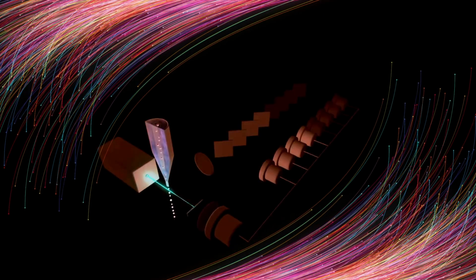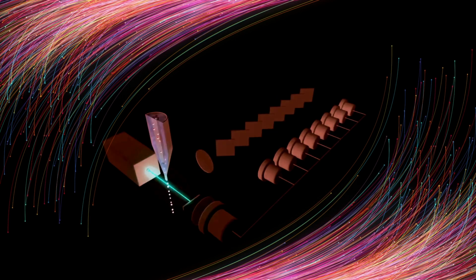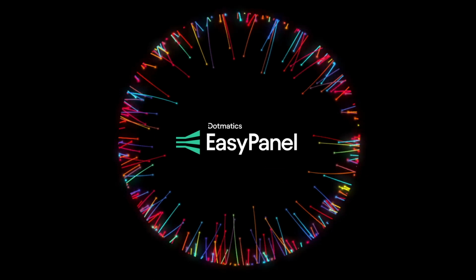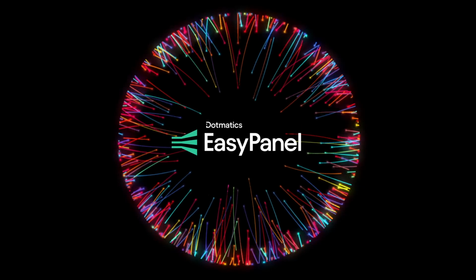One of the biggest challenges in flow cytometry panel design is selecting the right combination of fluorochromes and antibody conjugates so that the need for compensation and spillover adjustments is kept to a minimum. EasyPanel is a simple, free online tool for flow cytometry panel design.